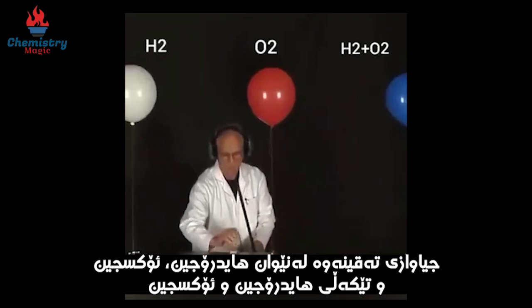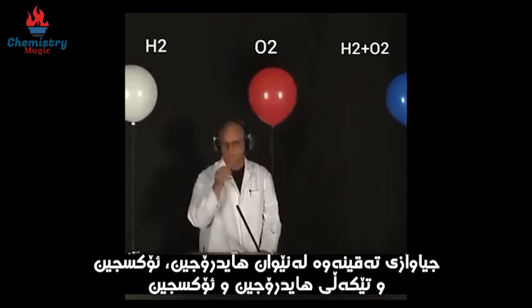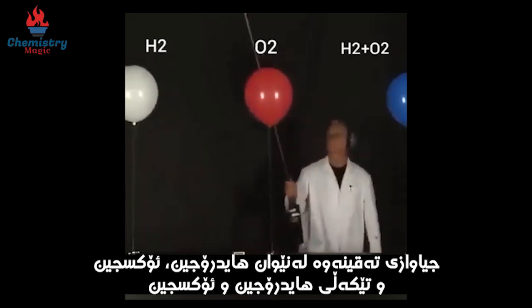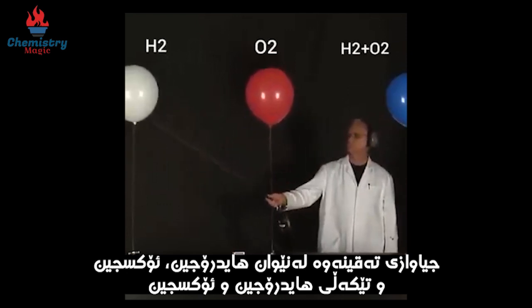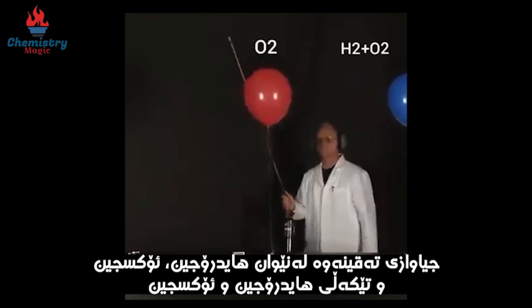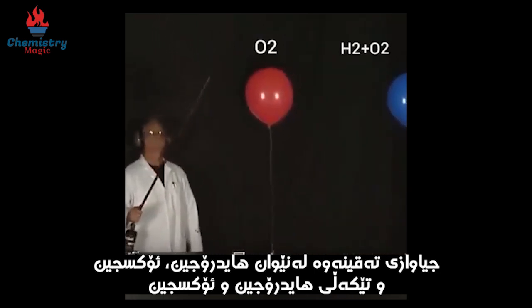First, Lonnie will ignite the hydrogen-only balloon. You can see an explosion, but a relatively mild explosion, as the hydrogen reacts with oxygen in the atmosphere.